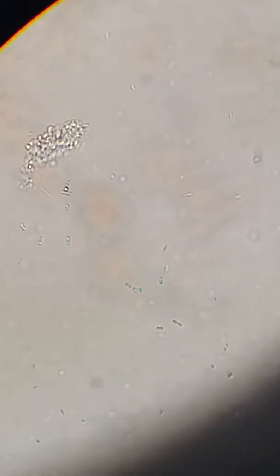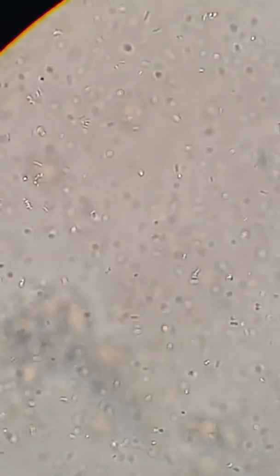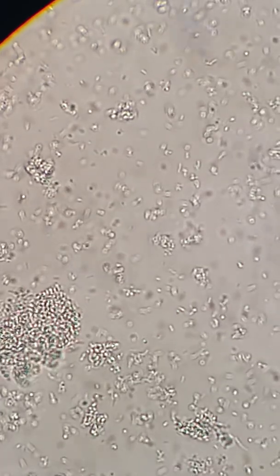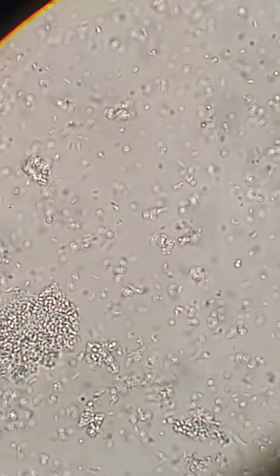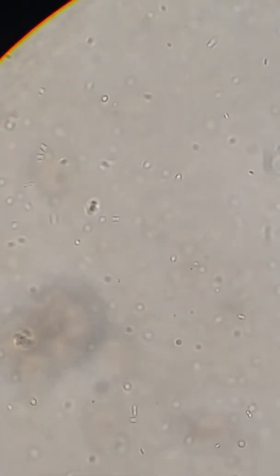And you'll be able to see, so you can identify what you're looking at. Sorry, I'm just intrigued and looking at the different depths and layers and what all is in there. So that's my assessment. It is definitely what they say it is. I would get this and take it myself.